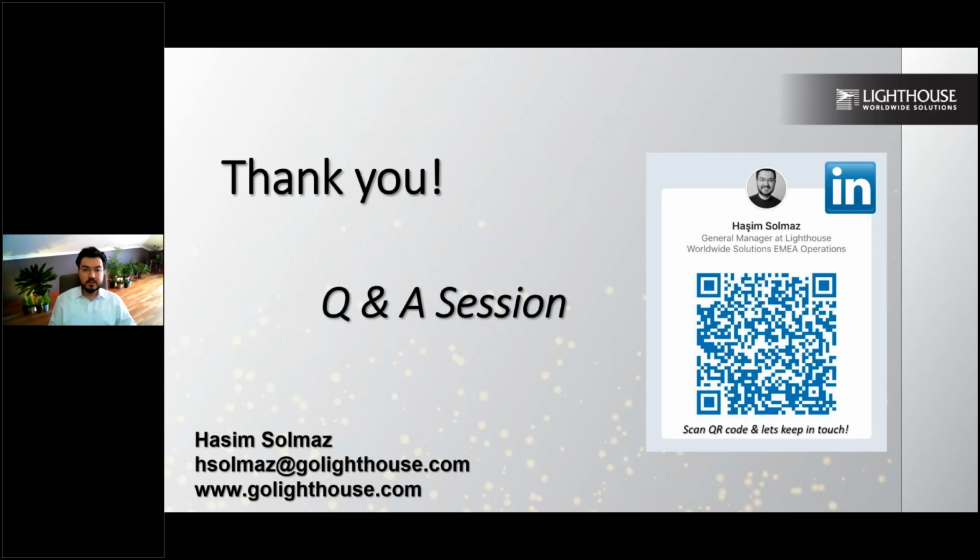You don't have to worry about that. In fact, you can verify whether your manufacturer is testing every single filter instead of making batch sampling. They should test every single filter, and these filters should be sent with an EN report along with devices, and you will be verifying it. Also, as a manufacturer, you can visit your supplier and verify their method and test their systems.